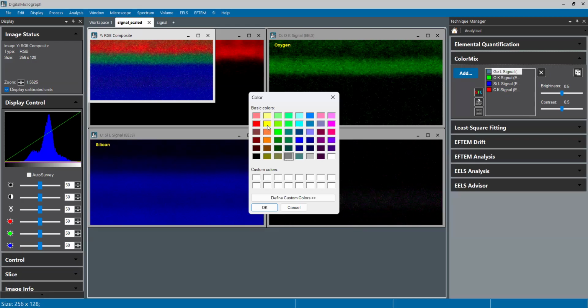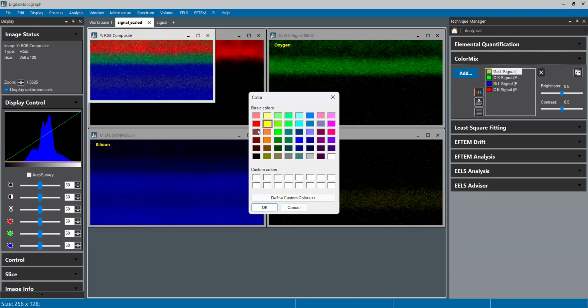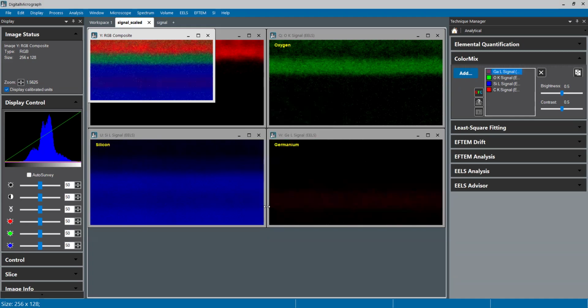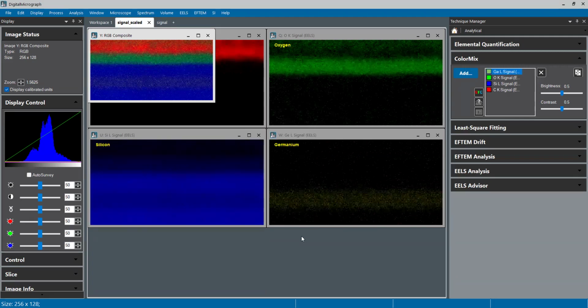So I found that the yellow, or the maize, the Michigan man that I am, actually came out the best in that case. And again, you can play around with some of the other ways that we're doing this. The carbon isn't overlapped with anything. So if we make this red, let's say. Yeah, that really doesn't help either. So okay, we'll just leave it on maize there.